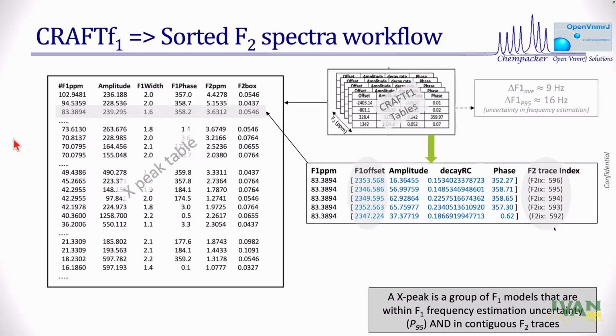That's a cross peak within this acquisition of this 2D, which happens to be HSQC, which happens to be run with 64 increments, which happens to be run with 150 millisecond acquisition. So whatever your input is, with that input, this is a set of models that belongs together.